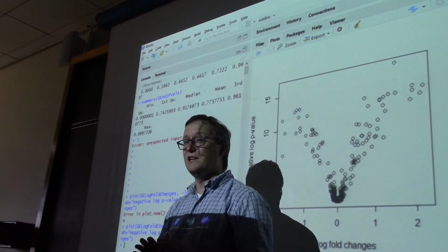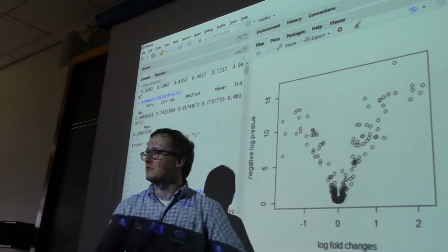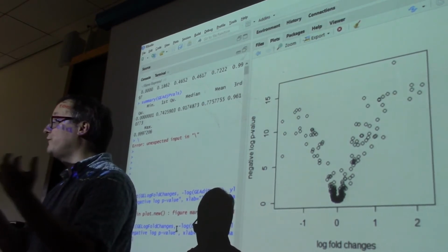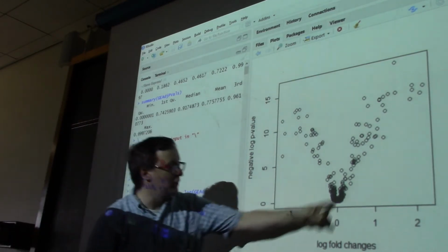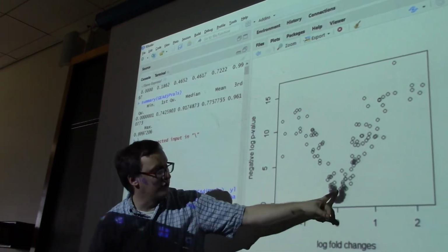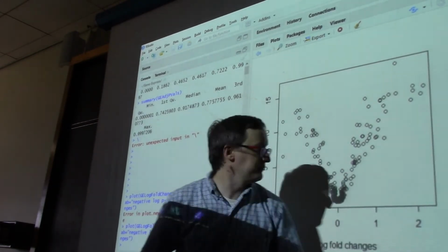What we have is called a volcano plot. I'm sorry, it's over on this side. So we have log fold changes on this axis. What do we get when red and yellow are the same level on a log fold change? It's a big 0. So we have a 0 difference between the red and yellow. When the ratio is 1, we fall right here on this midline. So these are up in red, and these are up in yellow.